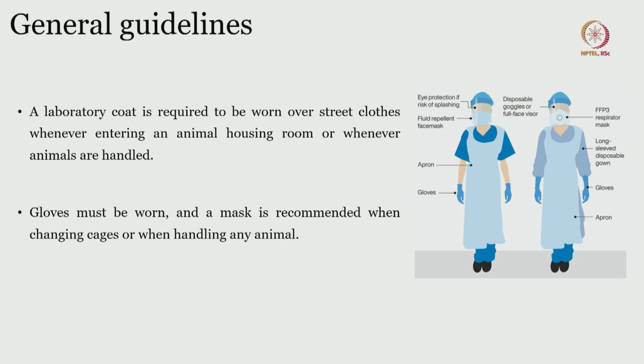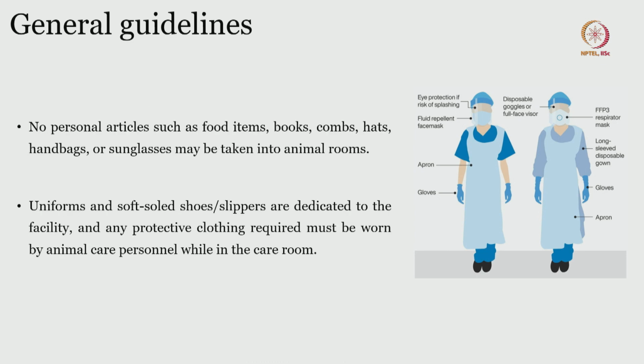If you're just going to, as I said, generally handle the animal, and maybe you're doing behavioral experiments where you're going to observe some behavioral changes and note them down, then this should suffice. If in addition you are going to do surgery after you enter, then this clothing should be substituted with a sterile gown and sterile gloves, and the entire set of sterile accessories needs to be worn. All right, so that is something to observe.